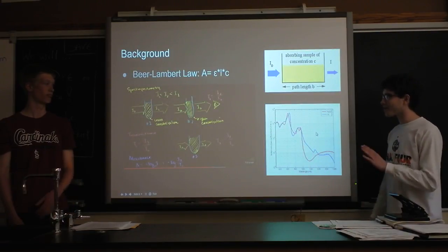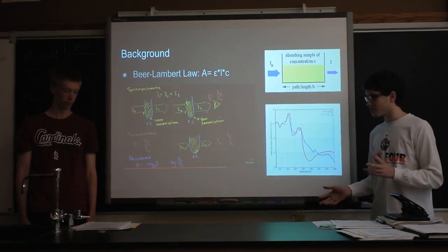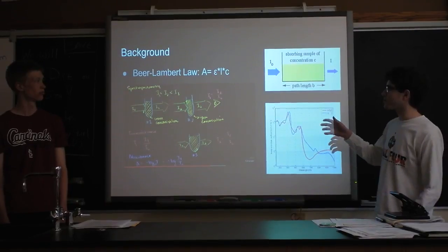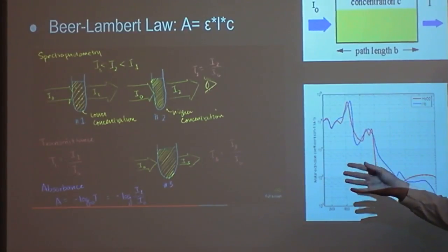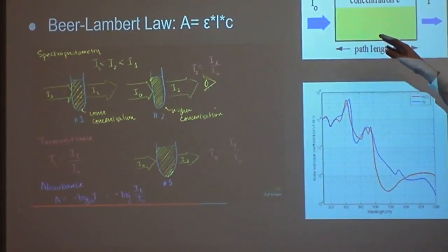So some background: there's one principle that this experiment uses, and it's the Beer-Lambert law, which says that absorbance is equal to the molar absorptivity coefficient times the length of what the light is passing through times the concentration. Explained through diagrams, it's really intuitive.